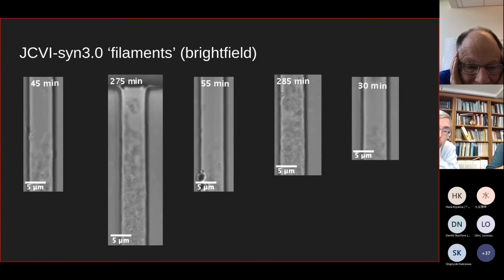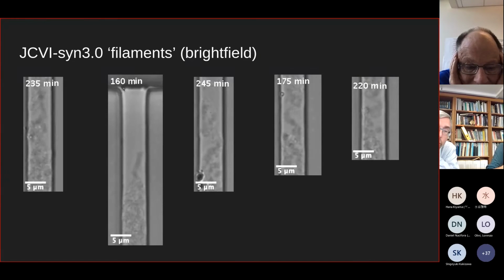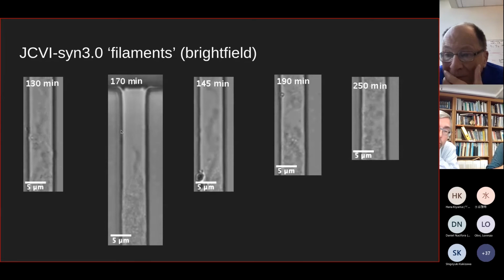Here, for example, because there's this flow coming up top, you can see that it induces some kind of shearing force, and it spins the filament into this little spiral.